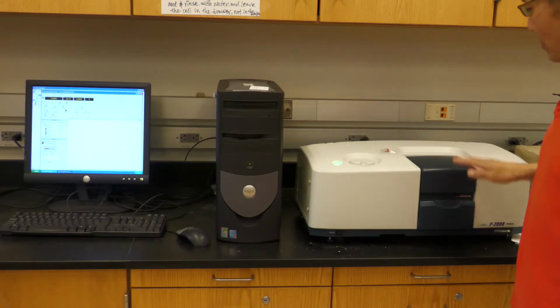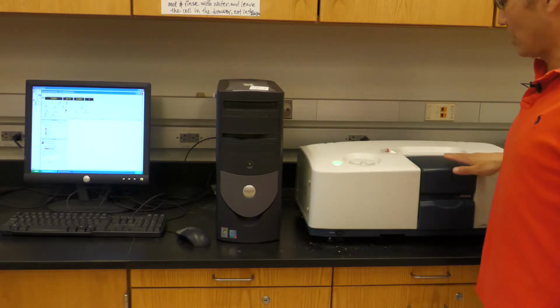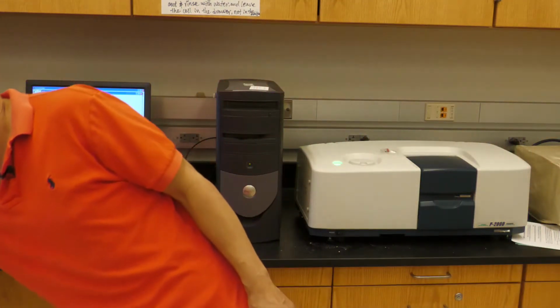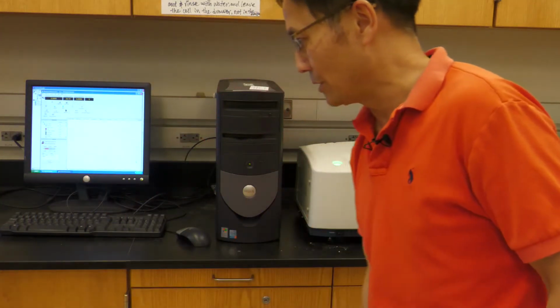The instrument we will use is this one. It's called a polarimeter, okay? So what is the general idea? What is the physical background of this one? Let me explain the physical background to you.